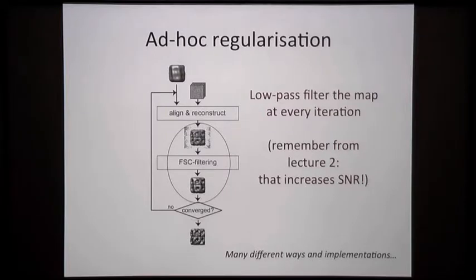If you're greedy and you don't filter much because you really like to see those high frequency components, then this noise might creep up and up and up. And Richard will describe that in more detail in his lecture as well. Okay, that's called over-refinement or overfitting.